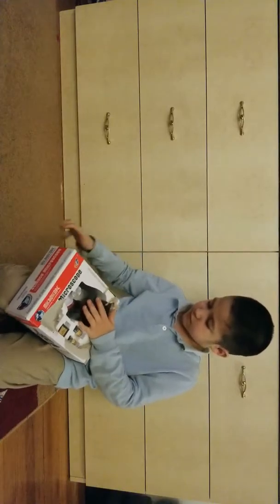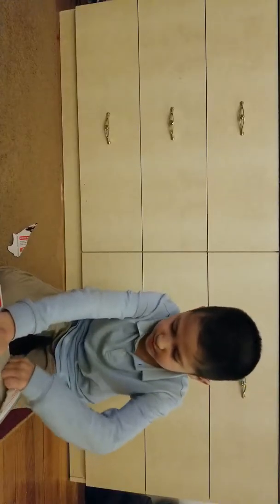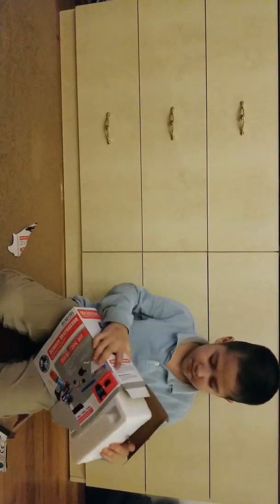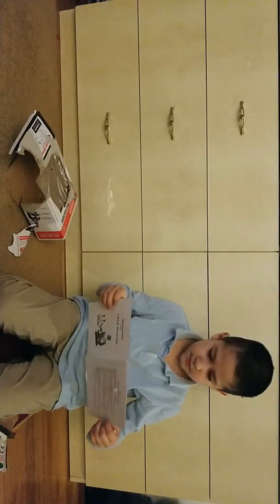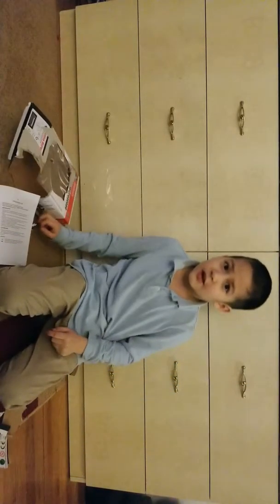Here it is. It's a little bit damaged, but let's open it. This thing is hard. It's made out of cardboard, but it's not a little hard. Right here — I got it out.